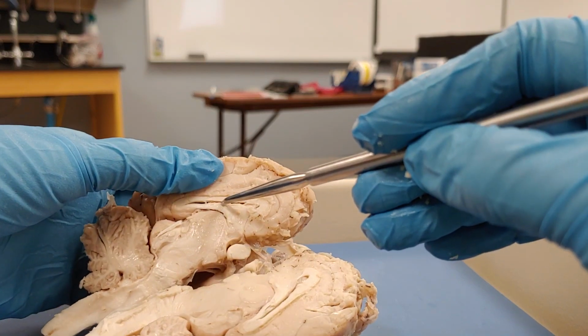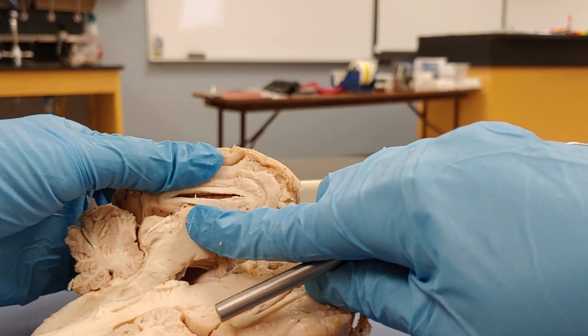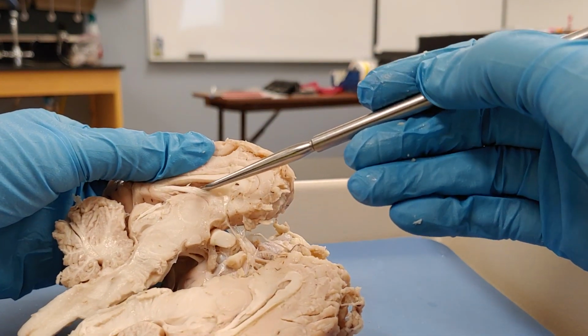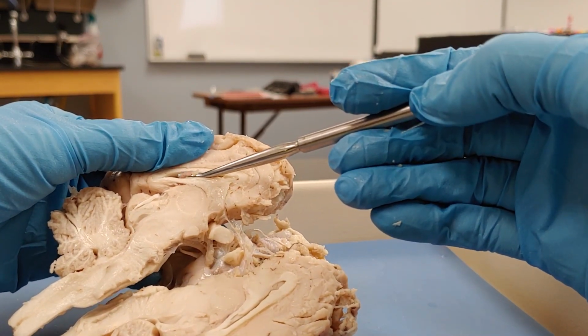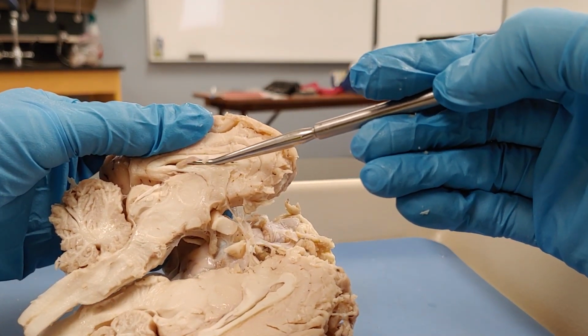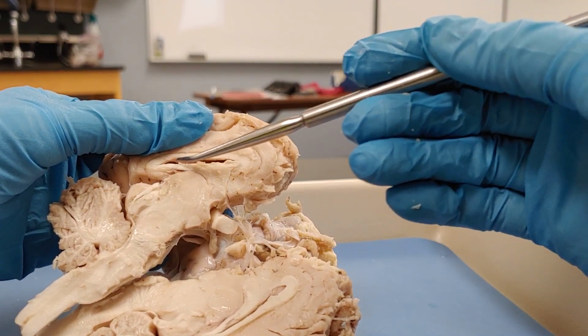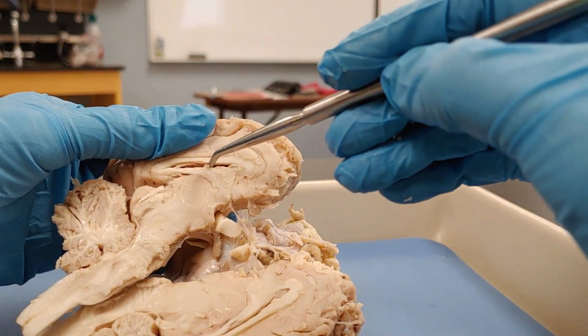If you look beneath that, you see the lateral ventricles. The lateral ventricle is the space inside the cerebral hemispheres, and inside of there would be the blood vessels that make up the choroid plexus. So that's what produces the cerebrospinal fluid in the lateral ventricles. So here's our lateral ventricle.